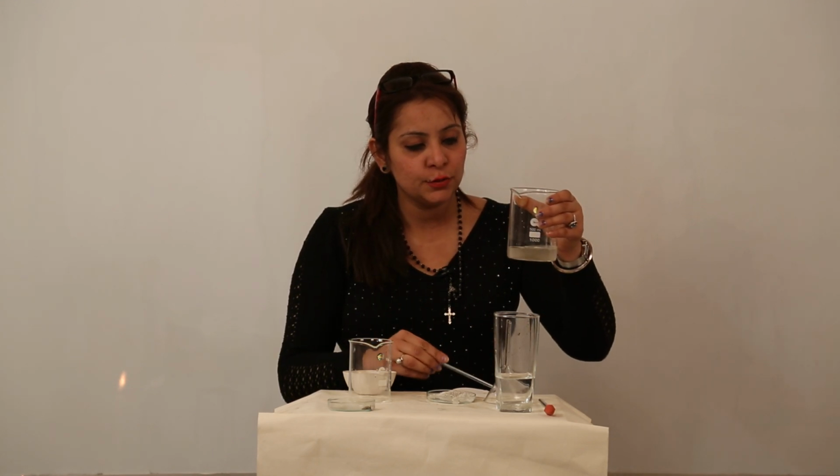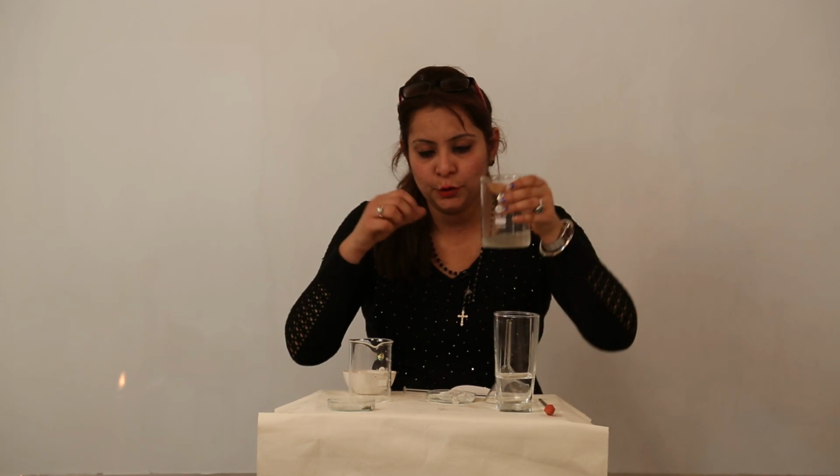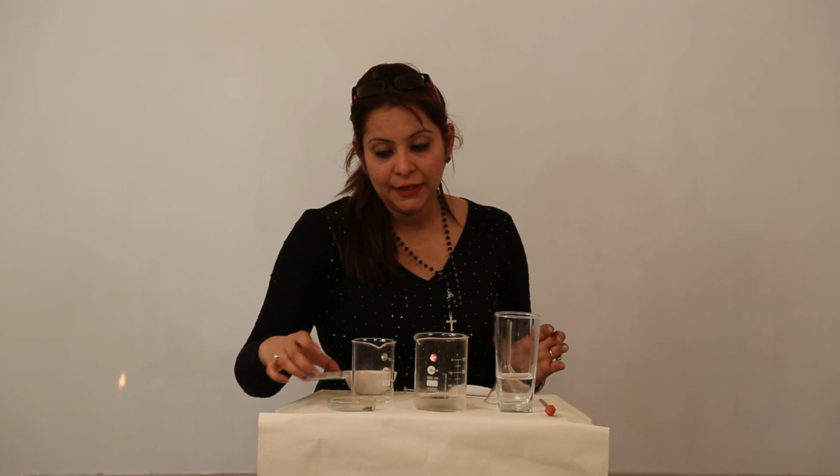I have tried to dissolve as much as I can, and I have seen that almost all the salt is dissolved in the water, but the sand hasn't, and a few particles look suspended in the water. So I have just kept it aside. Now, how can I separate one of the components from it? We know that salt is soluble and sand is not, so it settles at the bottom.